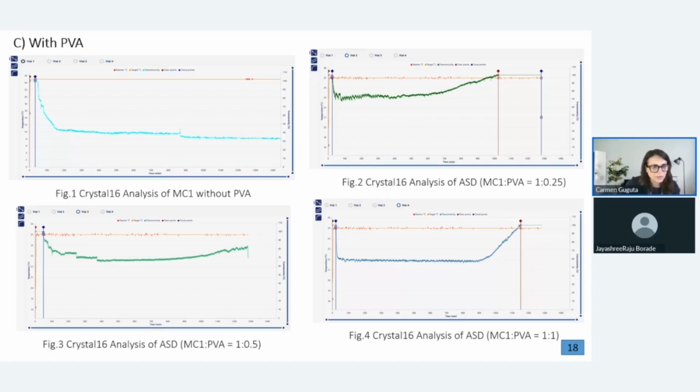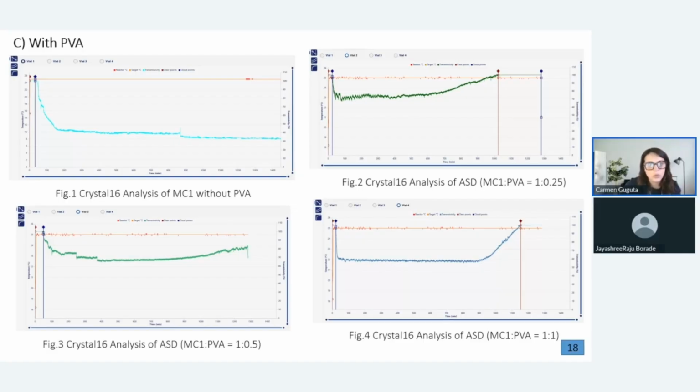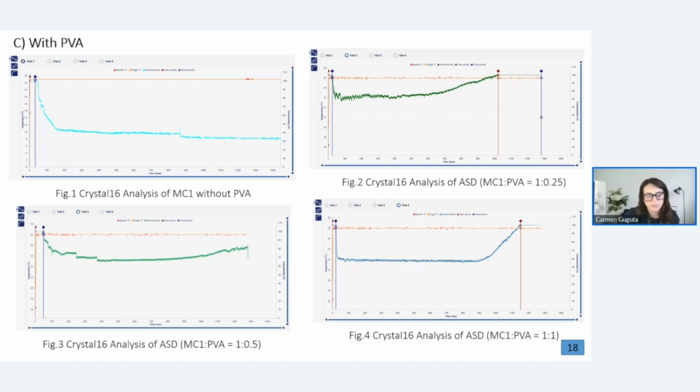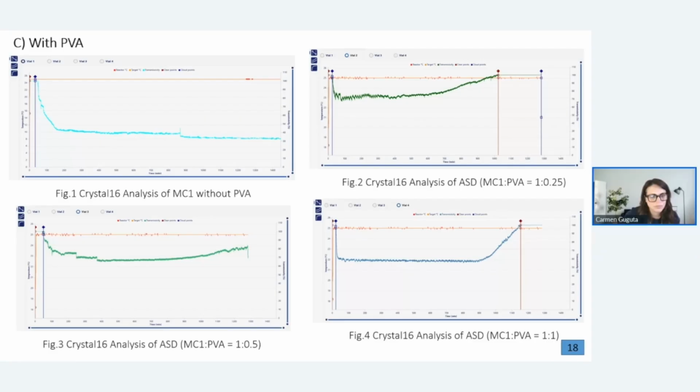Just one more question. Jayshri, thank you for your detailed experimentation presentation. What was the starting point of induction point? Was it the start of the experiment or after a specific saturation was reached? As I mentioned, first equilibration is needed, which was for 5 minutes, just with polymer. When I charged my API solution, the first drop in the transmission at that time point was the induction time we considered.